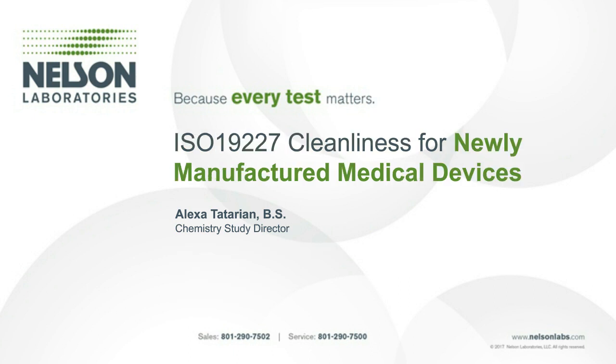The cleanliness testing that I'm going to be talking about is really related to newly manufactured medical devices. We're going to be talking about residuals and potential contamination that's left over from the initial manufacturing and cleaning of devices. These residues and potential contamination are those such as oils, greases, lubricants, detergents, polishing compounds, and particulates, really from that initial manufacturing and cleaning of a device or product. And so those are what we are going to be first talking about today.